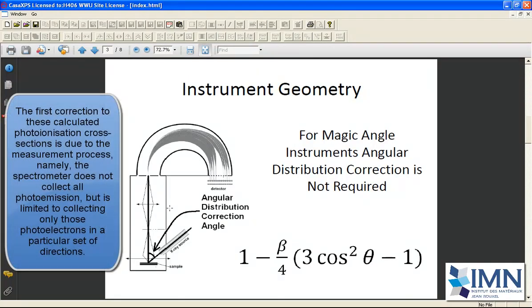Then we have an instrument interaction with this physical process. The physical process does not emit all electrons equally in all directions. And the fact that we have an axis of the analyzer about which we can collect the electrons, and there are other directions that we do not collect the electrons, we must compensate for the fact that this distribution is not uniform. And the angle between the x-ray source and the angle of the analyzer influences this distribution.